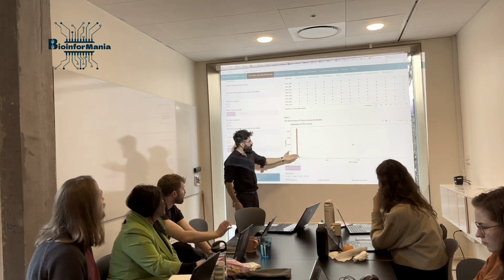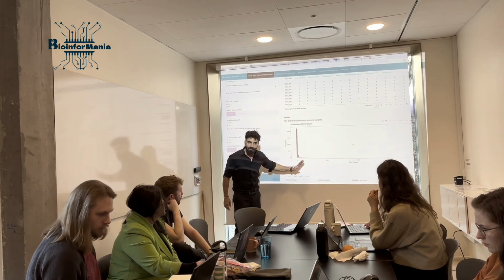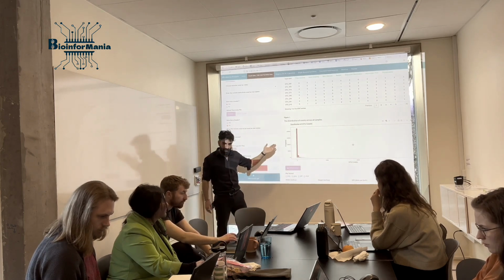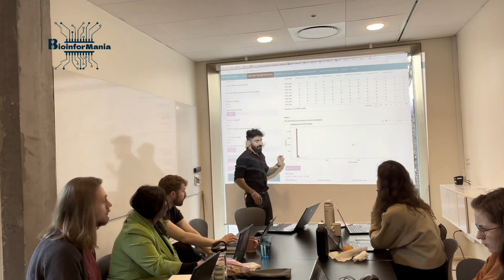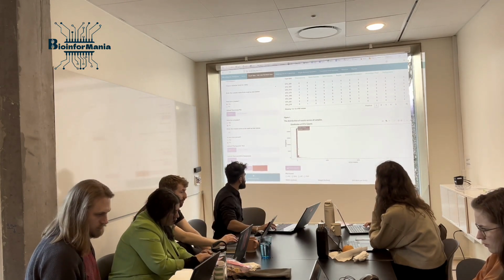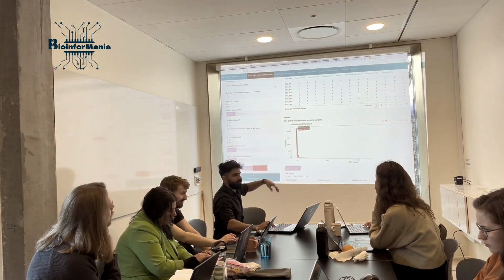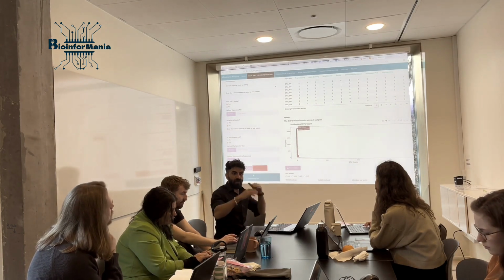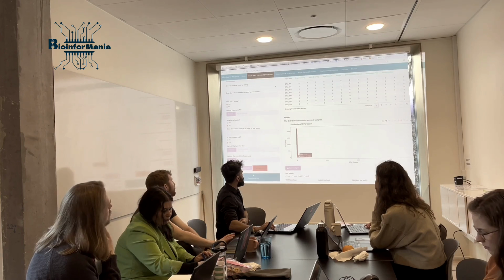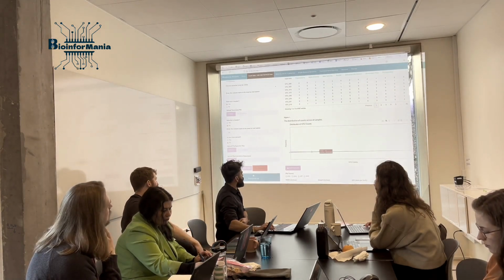Okay? So, first of all, we don't have negative data. This is discrete distribution, okay? So we have a lot of zeros. This is very sparse, okay? 0 or some positive values. If you hover over these bars, you can see the count, the number of the zeros. You have 22,205 incidences of zeros across the whole data, okay? And then it goes all the way down. And you also have something here, some little counts, okay?